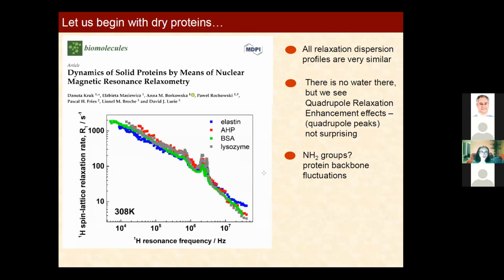So you can imagine, when you start talking about performing low field studies of proteins, immediately the question is, but we will not define any structure, the structure is already known. Then you start explaining that you would like to get some information about dynamics, but then the reviewer might ask what is so interesting about dynamics. So this is a kind of difficult problem. However, we started with proteins.